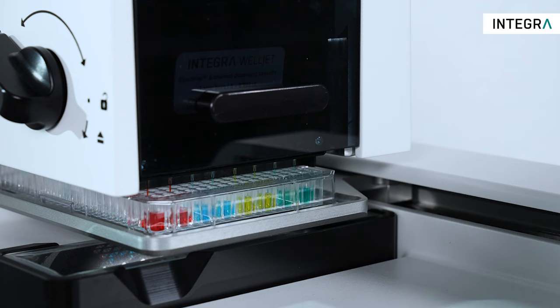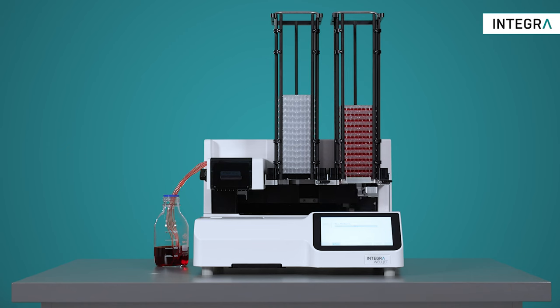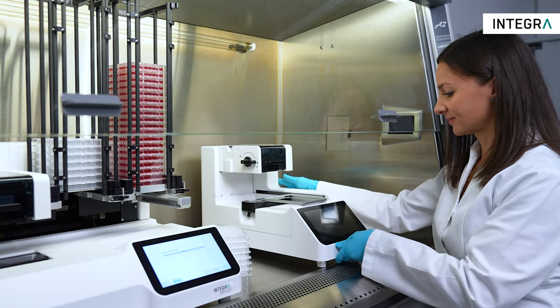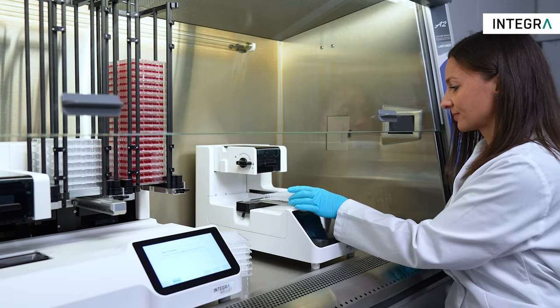Available in two different models, the WellJet Dispenser allows individual microplates to be filled quickly, while the WellJet Dispenser Stacker processes a stack of up to 50 plates hands-free in the shortest possible time. Both units have a very compact footprint, so they can be placed literally anywhere in the lab, including laminar flow cabinets.